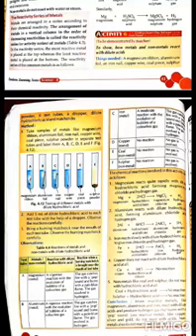In test tube D, copper metal was there and we observe no reaction at all.